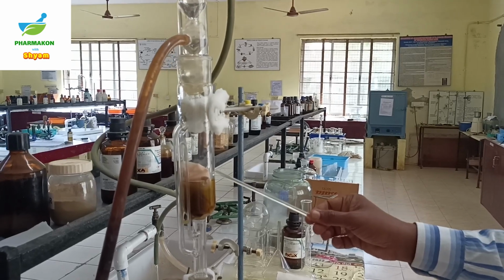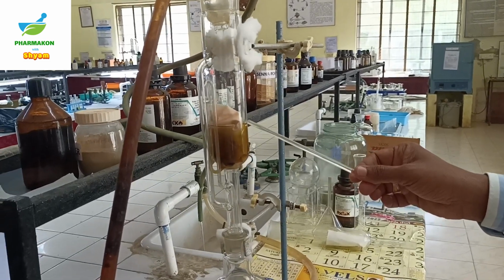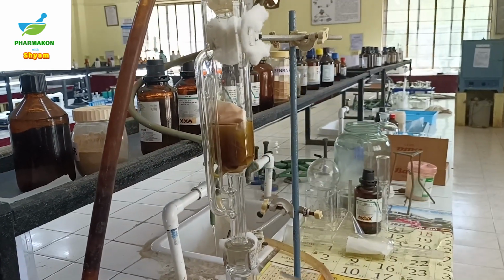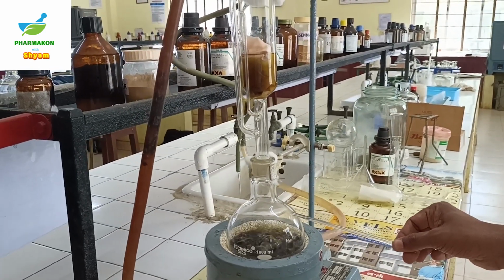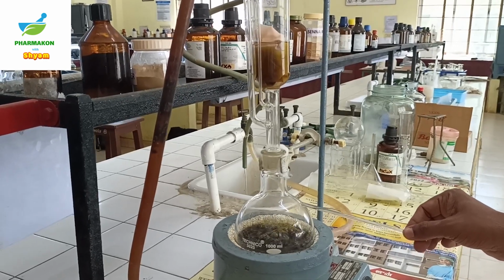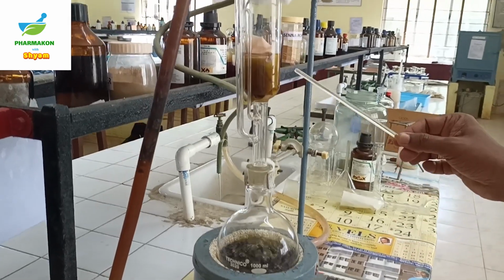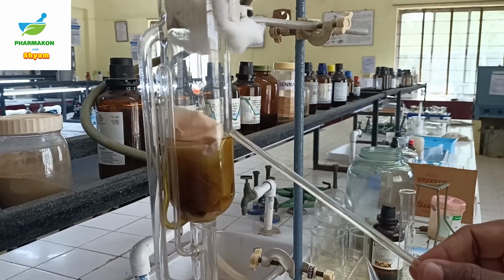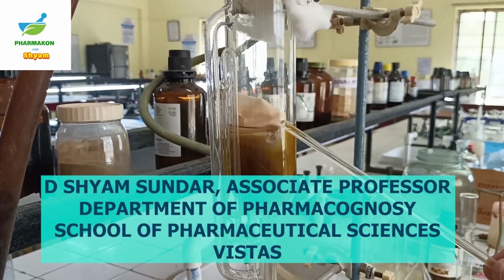The advantage of the Soxhlet apparatus is that the solvent it requires for extraction is very little, and also the solvent can be recovered using a rotary vacuum evaporator. The disadvantage of this method is that we cannot use thermolabile substances for extraction.